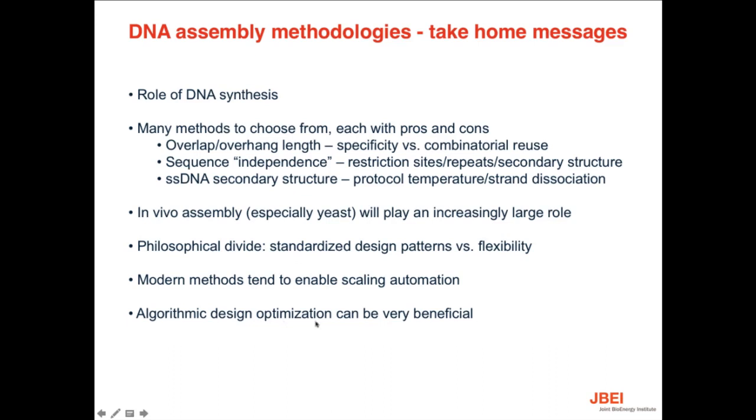And I think coming up right next, we'll be talking about some of the software tools that help you design protocols and at the same time allow you to maintain all of that great flexibility.